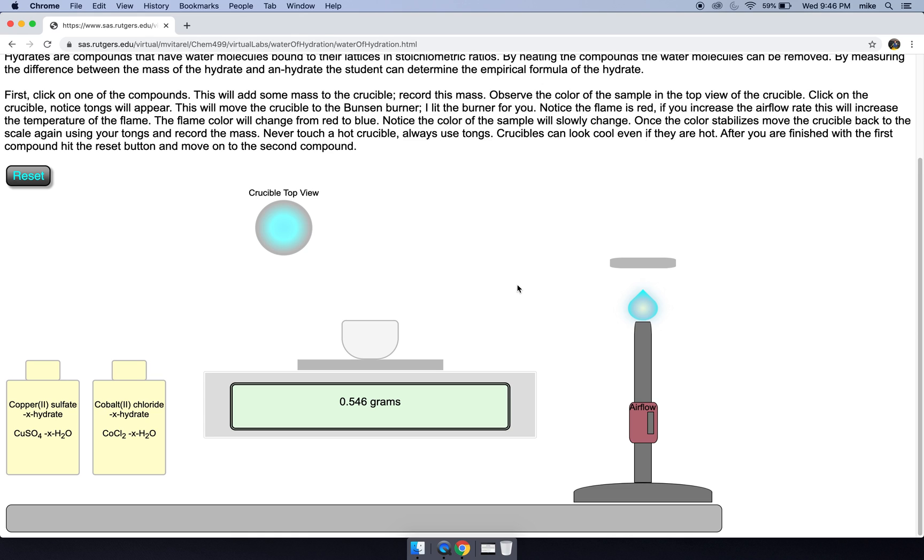Let's check it. 0.546 grams. Let's put it back, wait a couple seconds. Yeah, 0.546 grams and that's it.